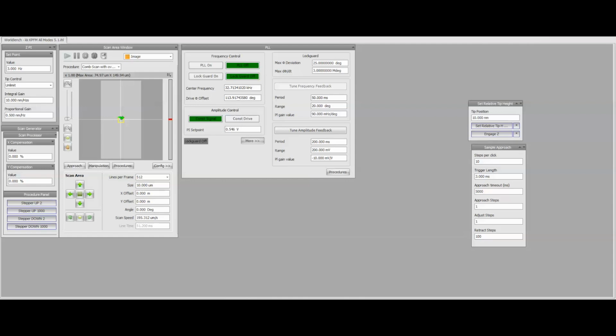I want to show you how to do something today with the R9 controller. I have a customer who has a special requirement. He wants to send out a TTL pulse out of his DAC1 with a 5-volt amplitude after each scan pixel in an image frame. He wants the pulse to have a configurable width, and he wants the pulse to have a configurable delay after it. So I'm going to record this little video to show how easy it is to make these changes.